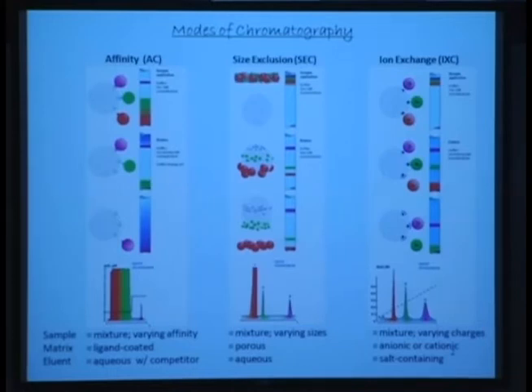So as and when possible, we try to use other techniques such as precipitation, for example. By the way, heparin is typically obtained through precipitation. Obviously, we have truckloads of heparin available from pigs and things of that sort. In essence, this is the method for anion exchange. Obviously, it works for cation exchange. You simply have to have a different matrix, the opposite type. Any questions on ion exchange?